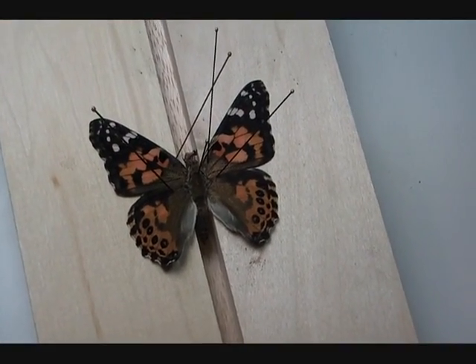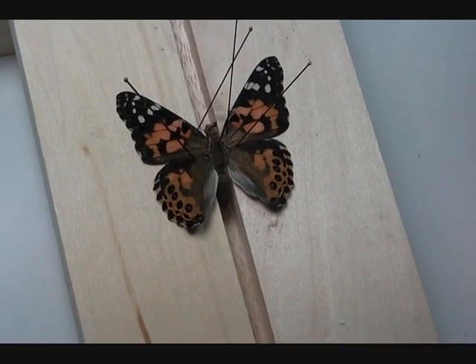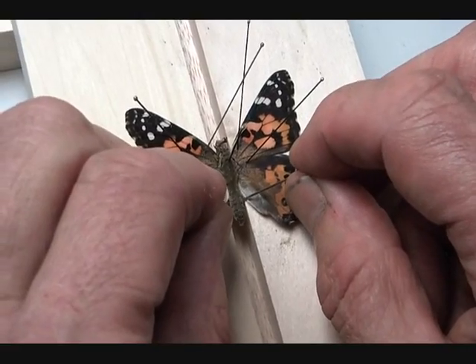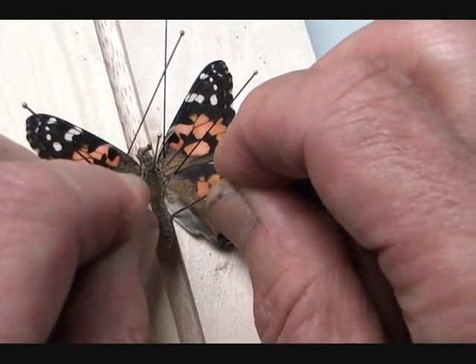You want to prop up the body because, especially if it's freshly dead, it will sag. So bring up the body and put two crossed pins underneath it just to hold it up.